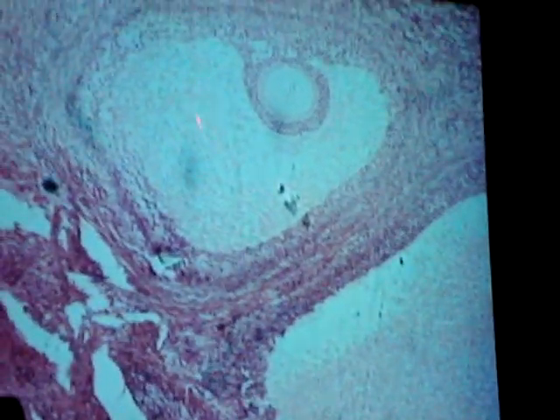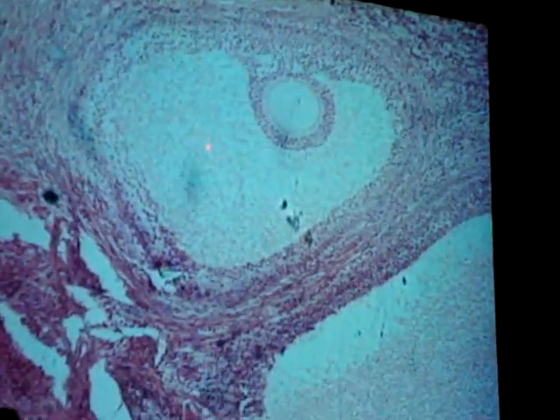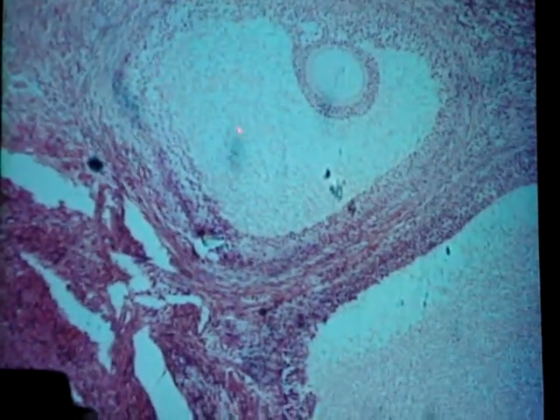Now the space that's in here is really not space. It's filled. They kind of refer to this as some kind of milk or nourishment here. But all you have to know is that that space is called the antrum. Space is the antrum.